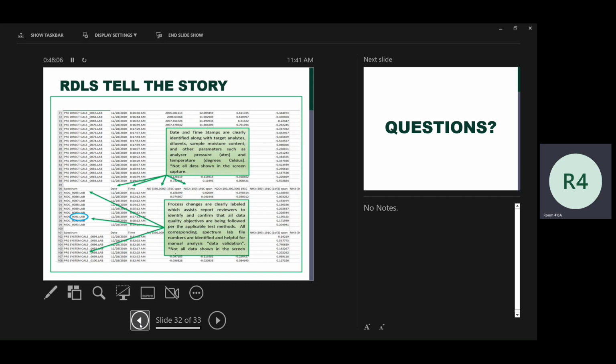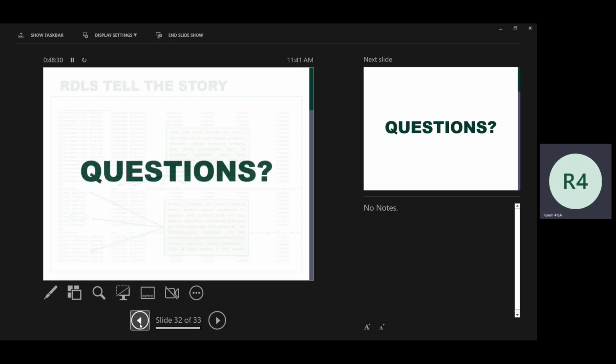So we go through. So it's a pre-direct cals, which we do for the FTIR, and then you have your MDC, which takes a full 10-ish minutes. I can add up. That's actually 8 minutes. A full 8 minutes for the MDC as per required. When you're sampling at limited intervals, you've got to do 8 minutes. Maybe you can increase your scan time to every 8 seconds and have a garbage load of data, but I don't think anybody wants to see that.